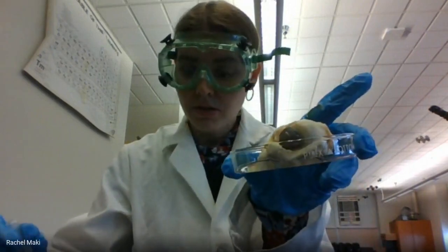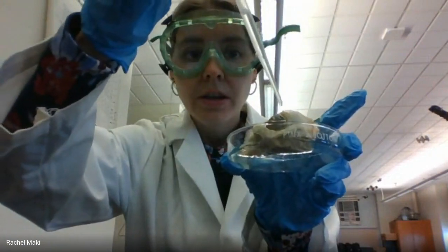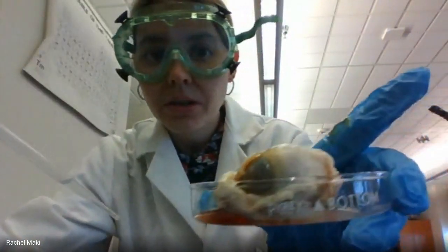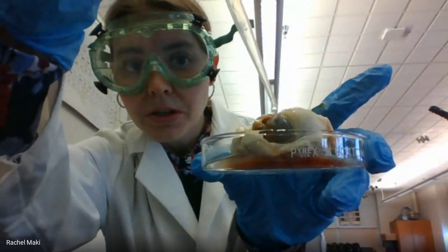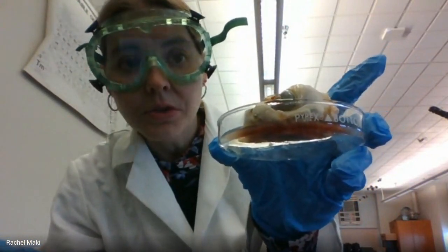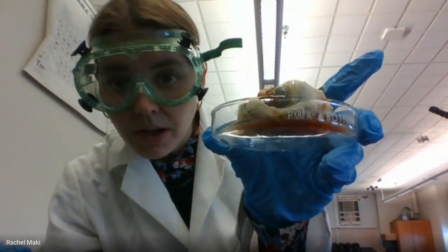Here's the eye, and I will just add acid right on there. I don't know if you can hear. You can see it's starting to get a little bit cooked. You can see the liquids got that kind of reddish color to it. This is a preserved eye. There's no blood in here, but you can see that it is breaking down the parts of that eye.